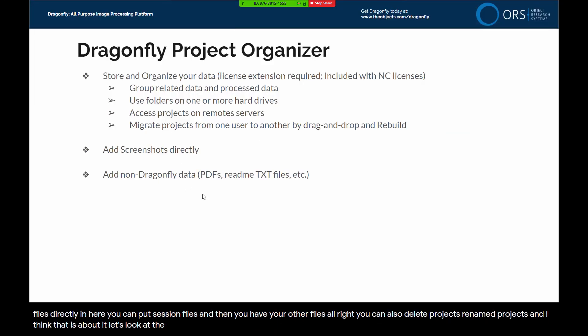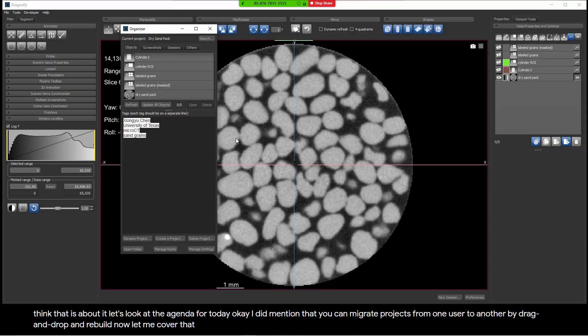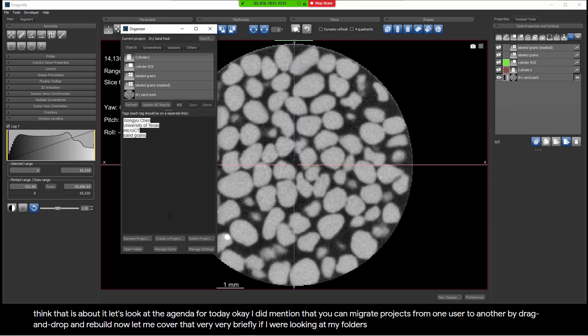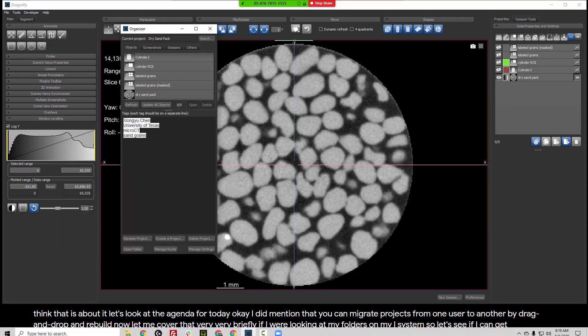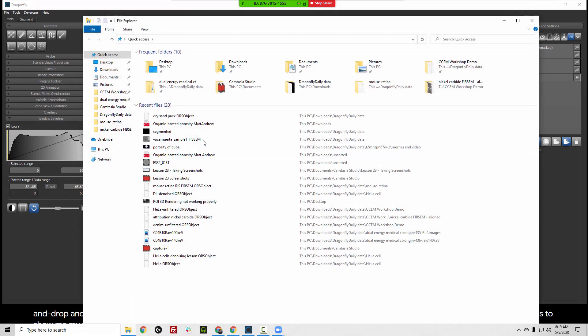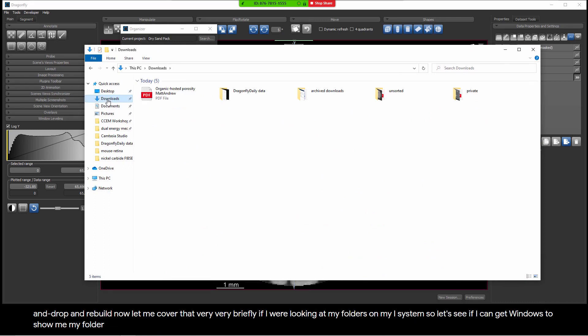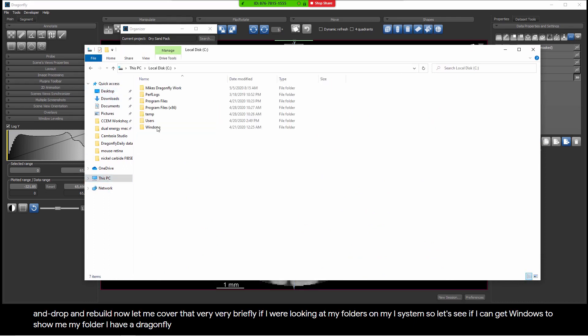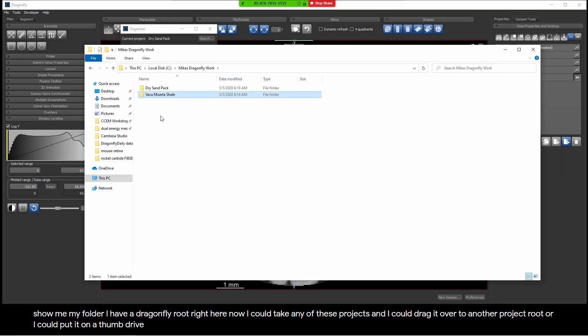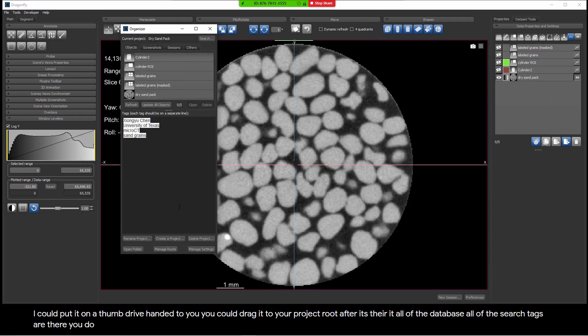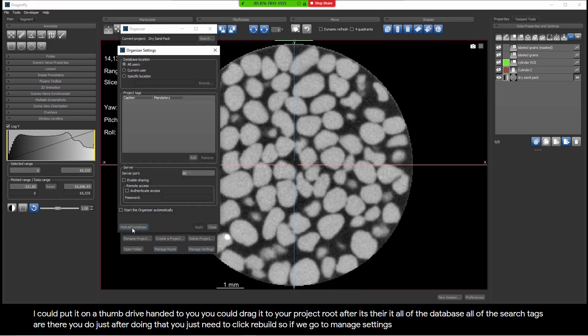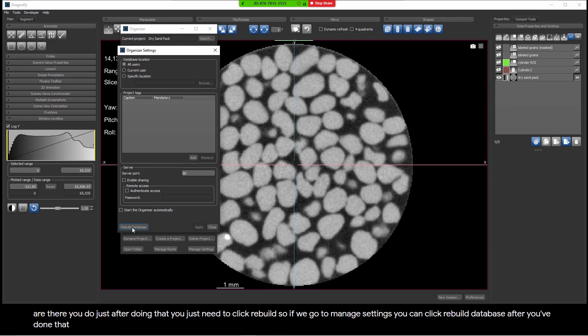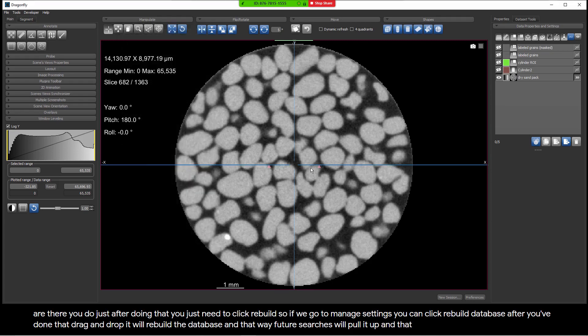Let's look at the agenda for today. I did mention that you can migrate projects from one user to another by drag and drop and rebuild. Now, let me cover that very briefly. If I were looking at my folders on my system, I have a dragonfly root right here. Now, I could take any of these projects and I could drag it over to another project root or I could put it on a thumb drive, hand it to you. You could drag it to your project root. After it's there, all of the database, all of the search tags are there. You do just after doing that, you just need to click rebuild. So if we go to manage settings, you can click rebuild database after you've done that drag and drop. It'll rebuild the database and that way future searches will pull it up and you'll be able to find that project.